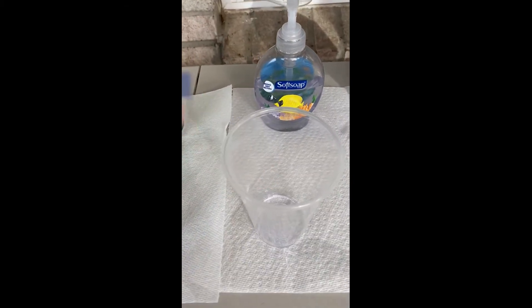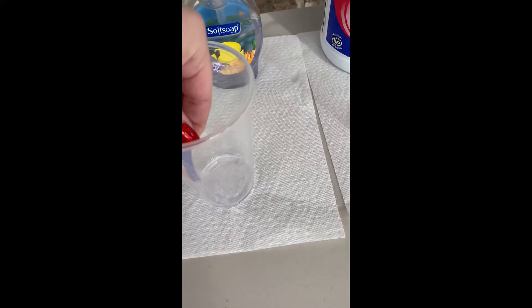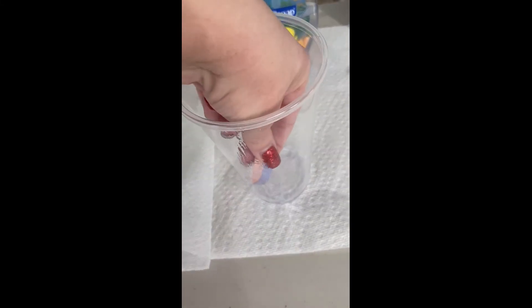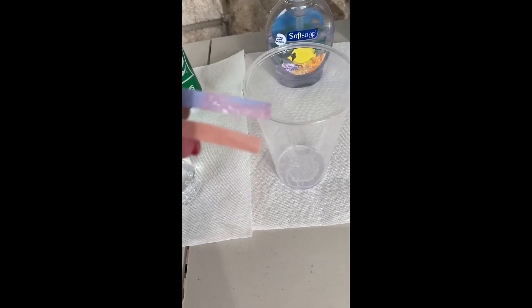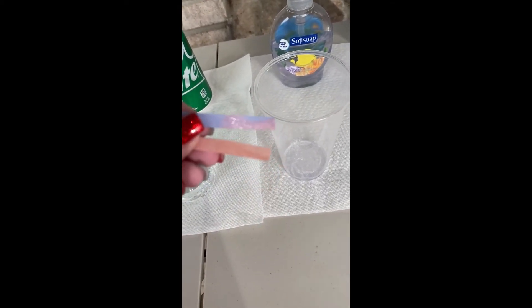Hand soap is up next. The hand soap is actually on the side, so I had to rub it so it could get on the paper. You can see that the blue litmus paper did turn slightly red, so this is going to be an acid.